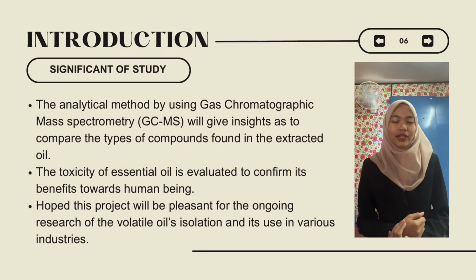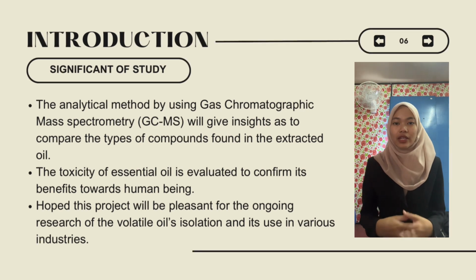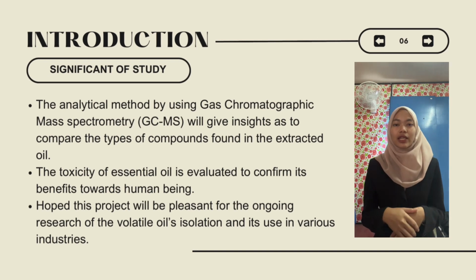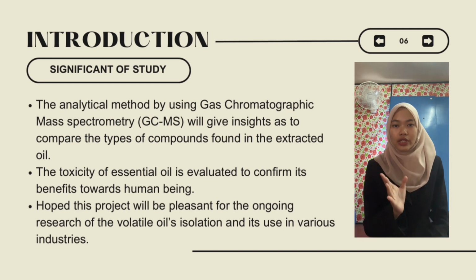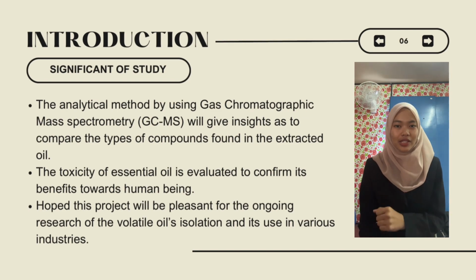Next, for the significance of the study, the current environment and economic conditions had inspired us to improve ginger's technology. The analytical method of gas chromatography mass spectroscopy, or GCMS, will give insights in identifying compositions in the essential oil. The toxicity evaluation also will give great impact to our population and industries. Hence, in this study, I hope it will give a pleasant further research of essential oil and its toxicity.